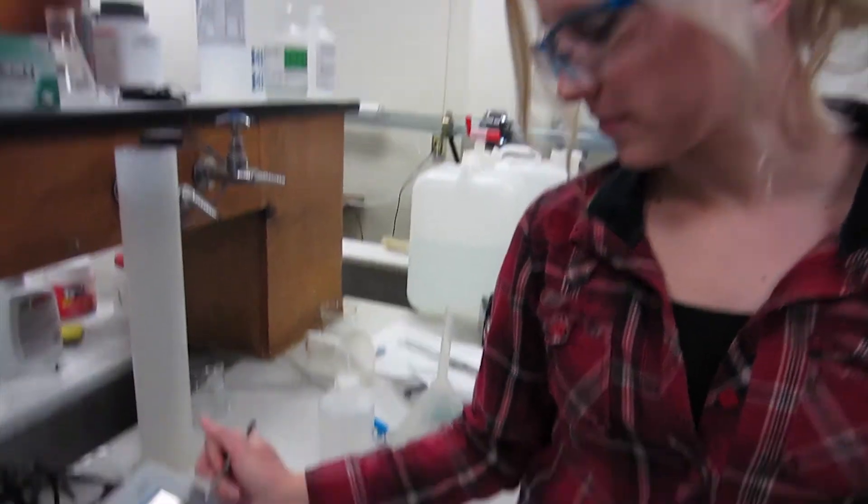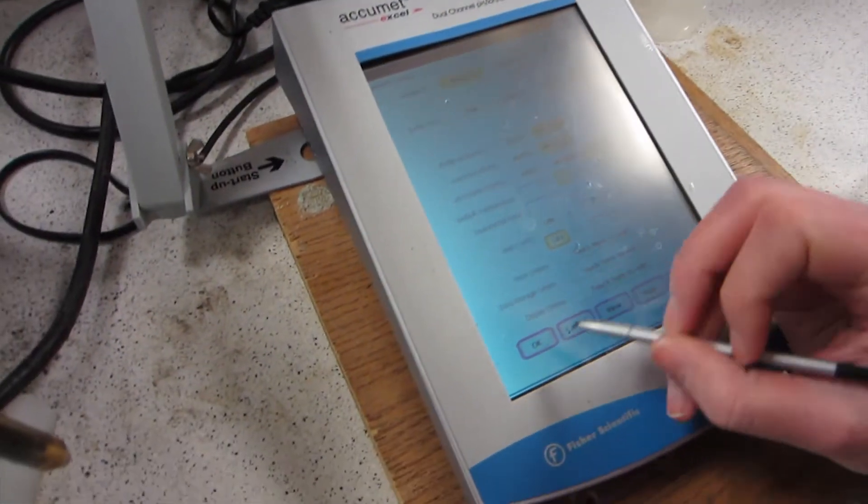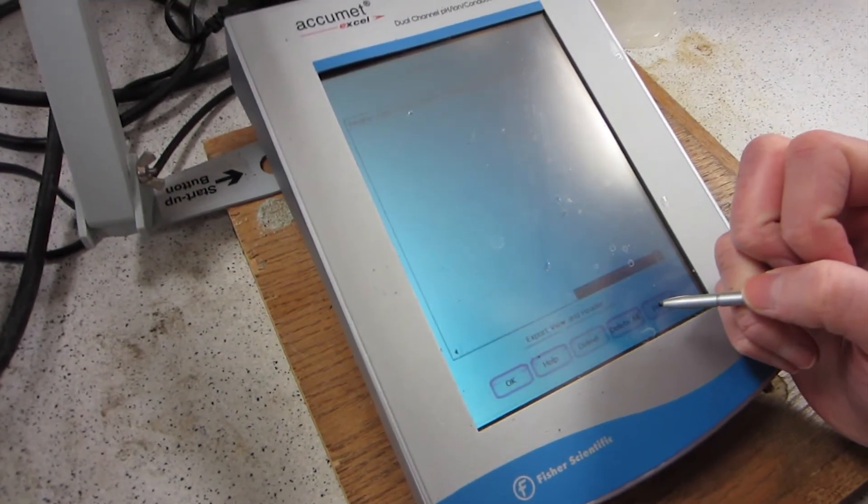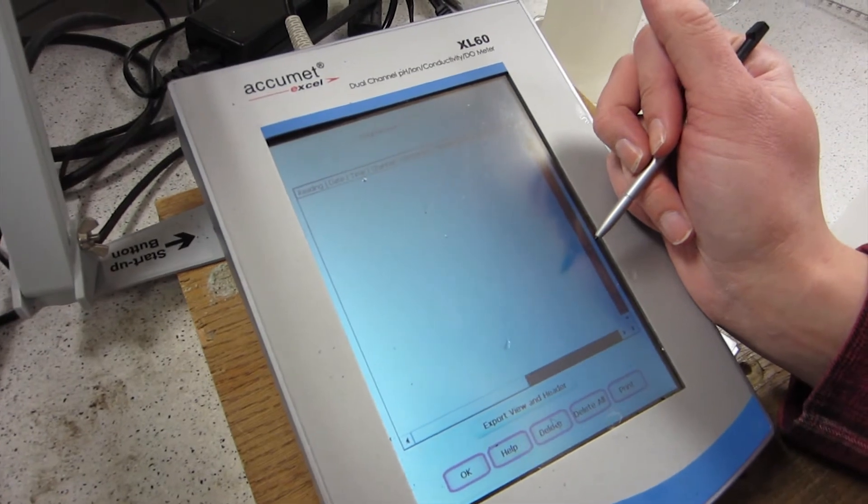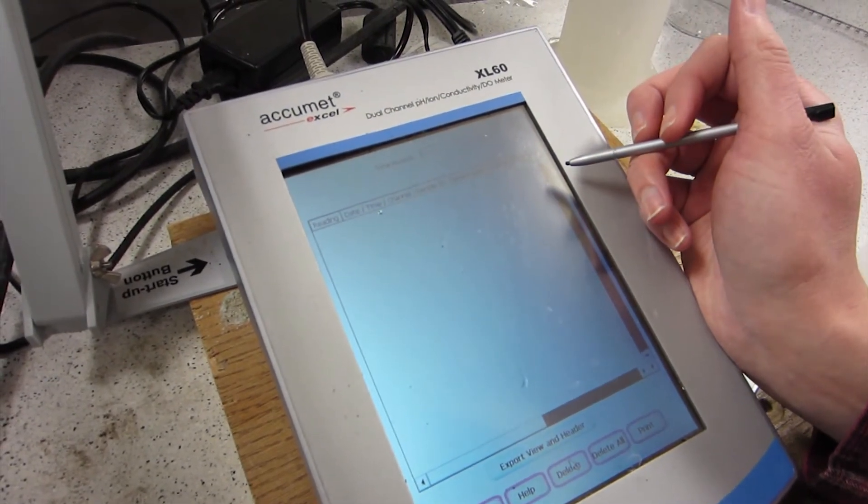You're going to go to setup, and then you're going to go to view. That will show you all the data points that have been taken. So in order to get this off, as you can see, it's pulling it up right now.